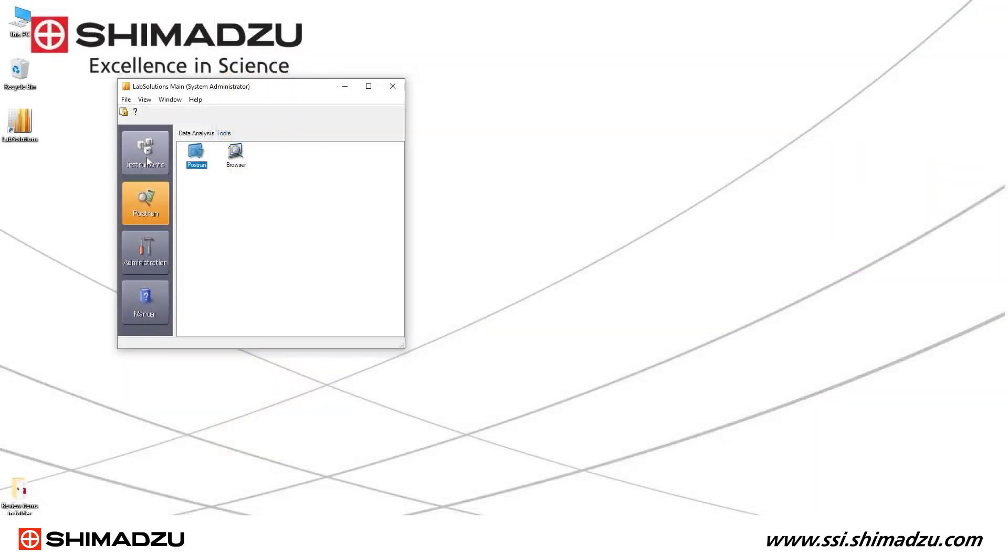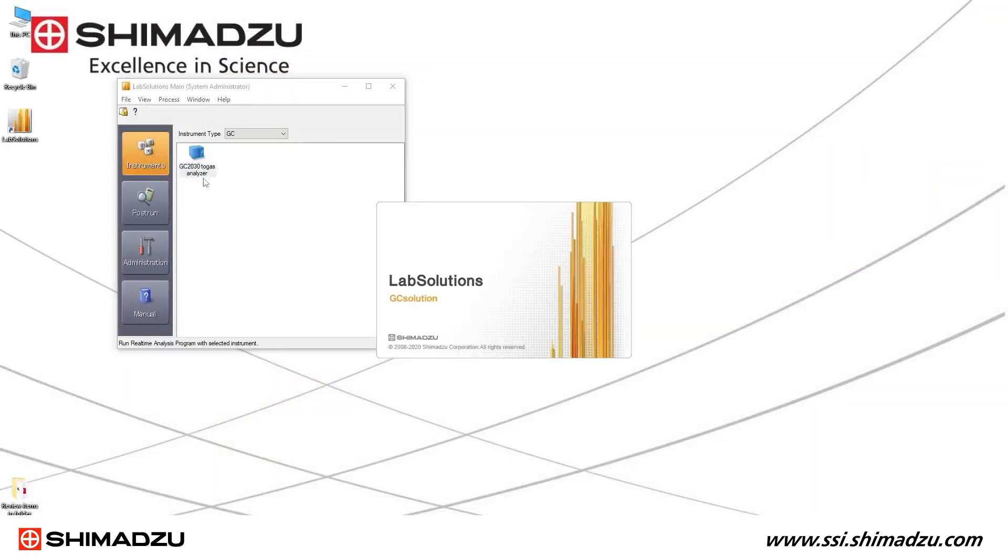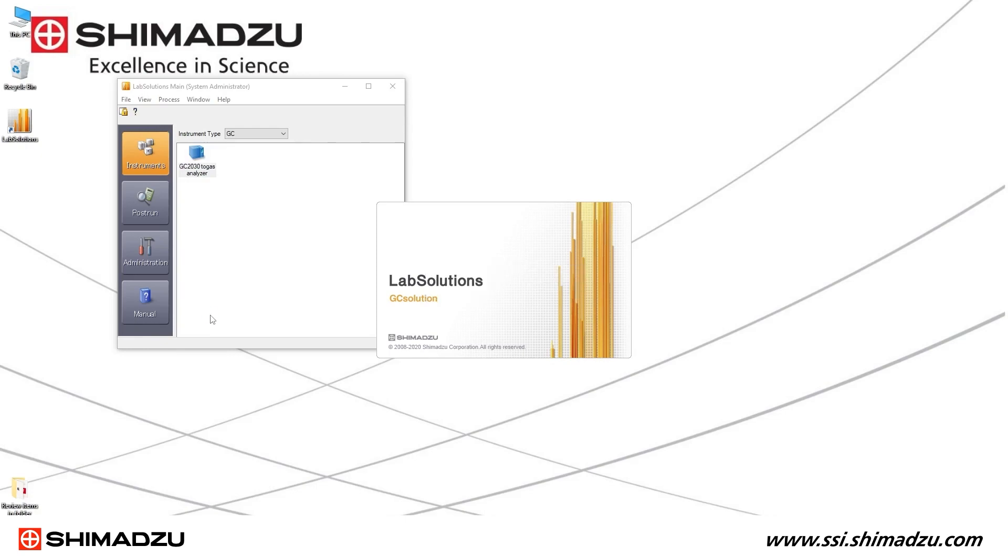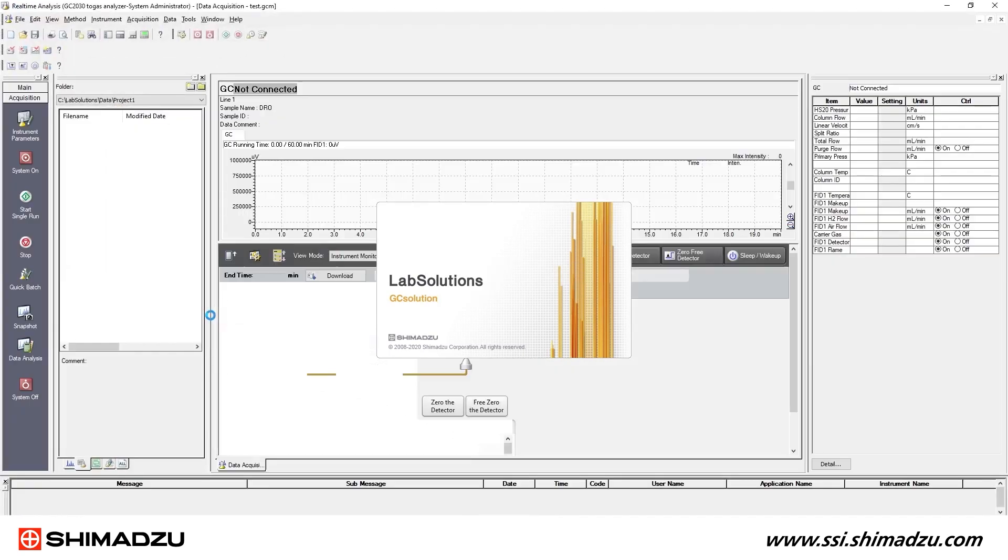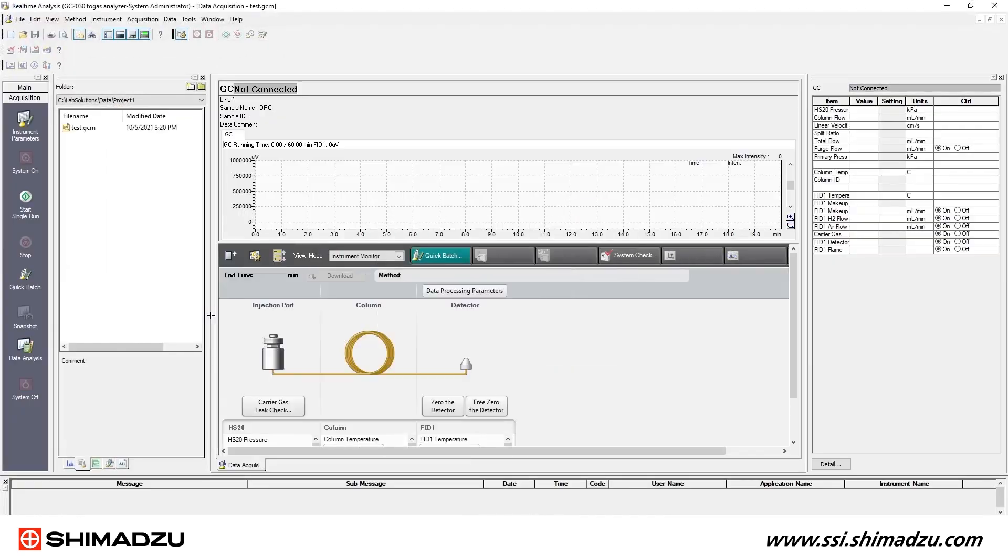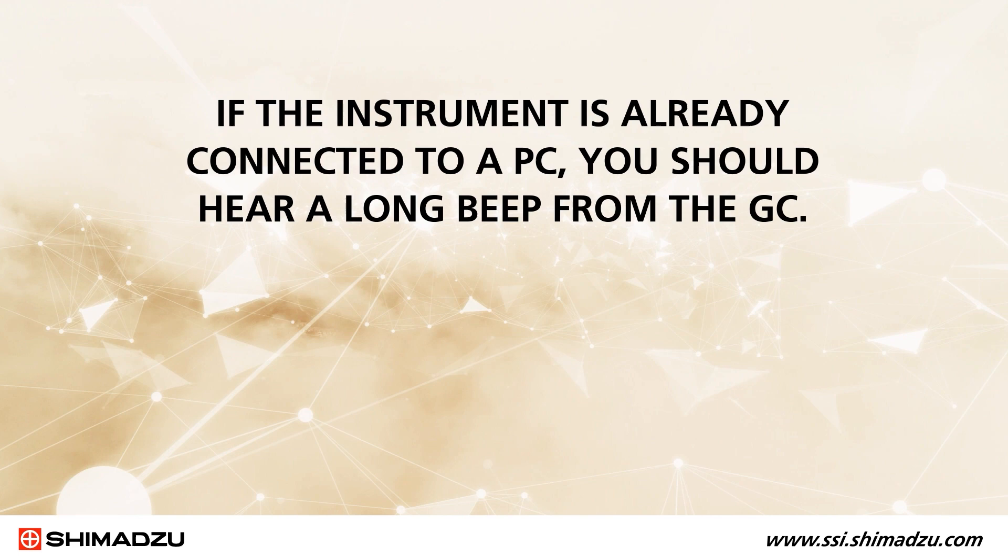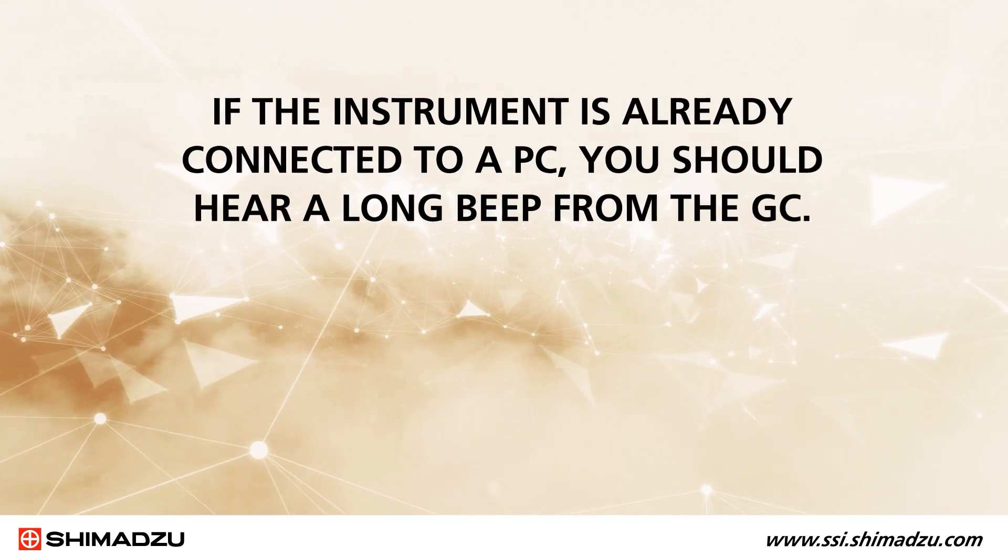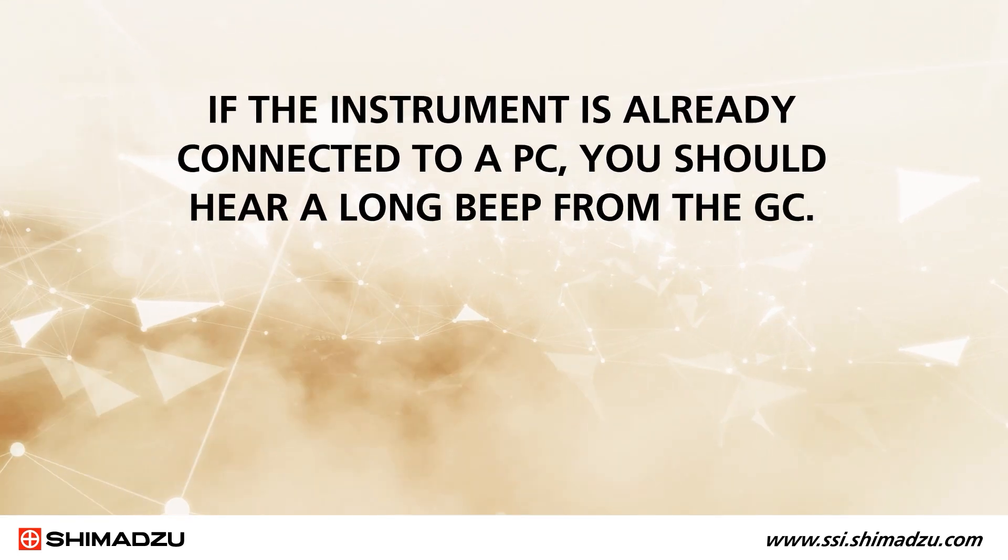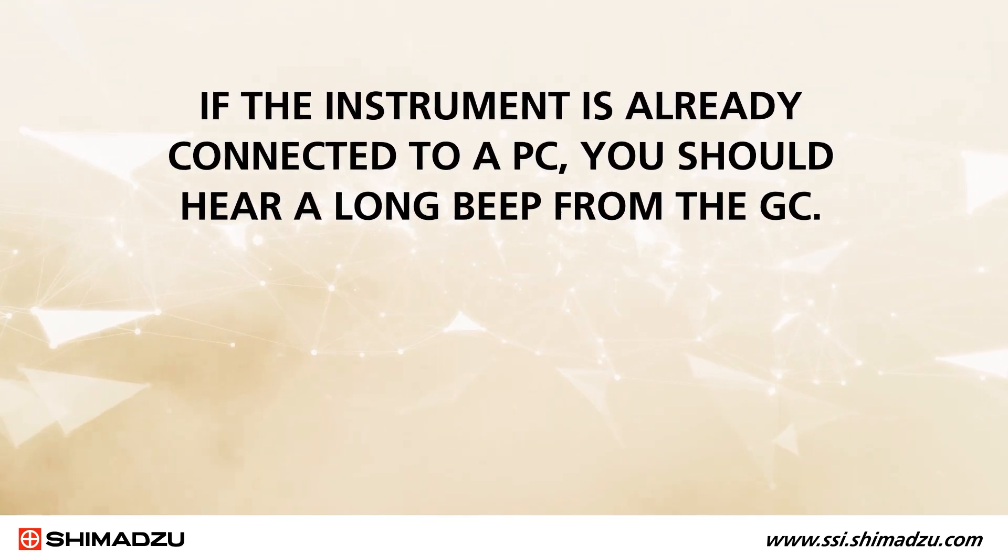Now open the LabSolutions Instruments menu. Double-click on the instrument you want to configure. If the instrument is already connected to a PC, you should hear a long beep from the GC.